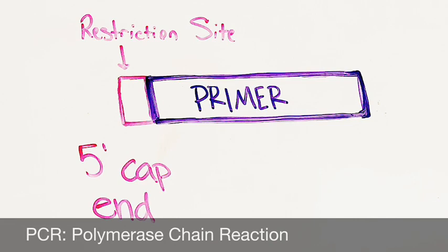When selecting a restriction site to add to the primers, it is important to determine which site will be compatible with your selected vector, whether directional cloning is desired, and, most importantly, confirm that the recognition site does not occur within the gene or DNA fragment.